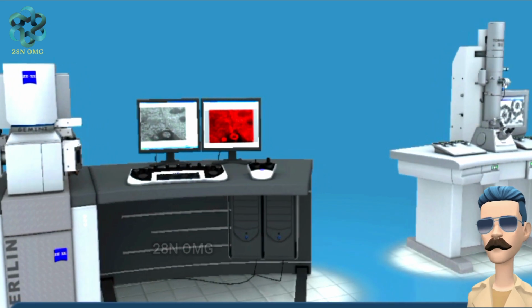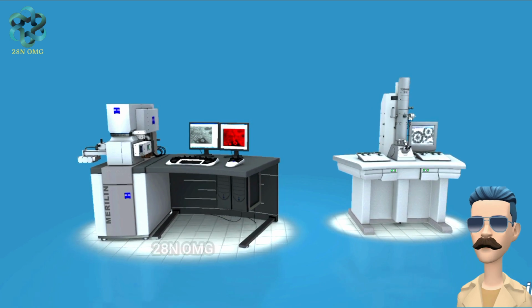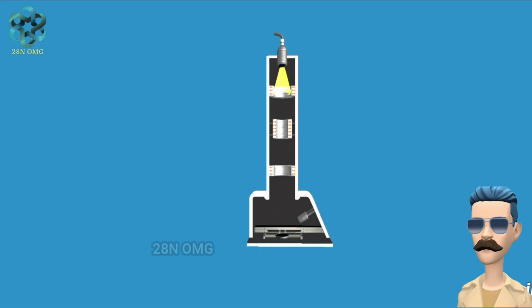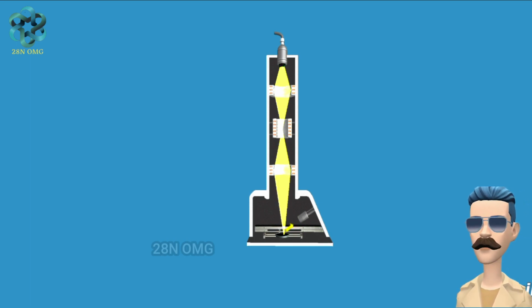A microscope is an instrument used to see objects that are too small for the naked eye. One of the most important properties of microscopes is their resolving power. In electron microscopes, an electron gun emits an electron beam, which focuses on the subject by electromagnetic lenses.